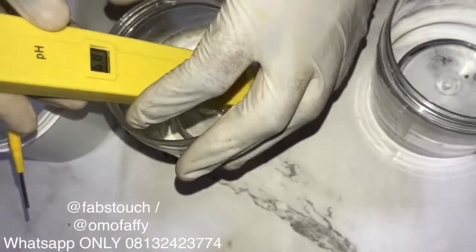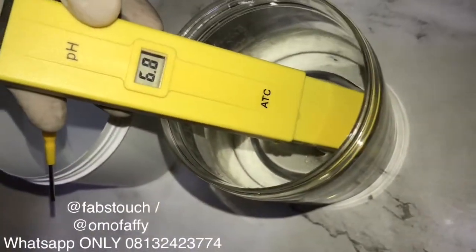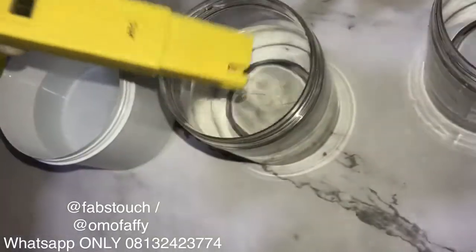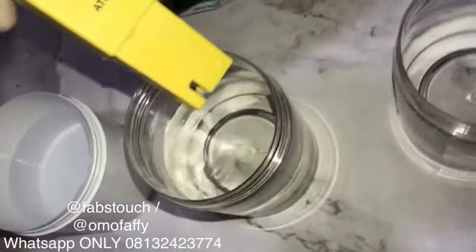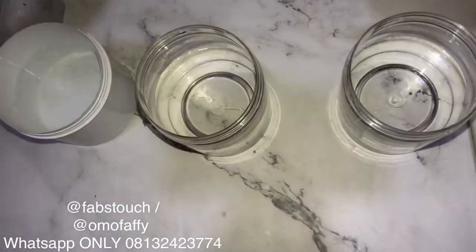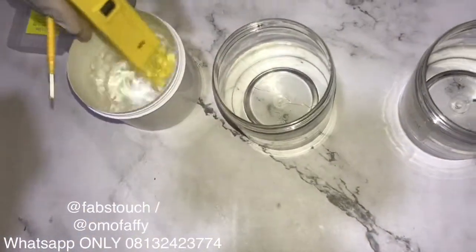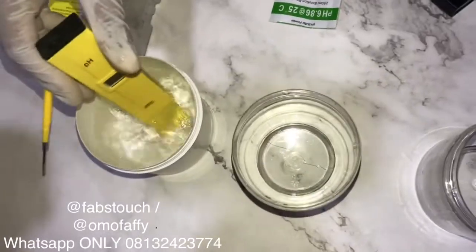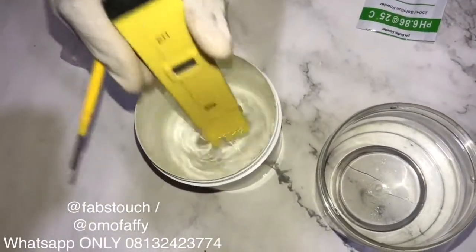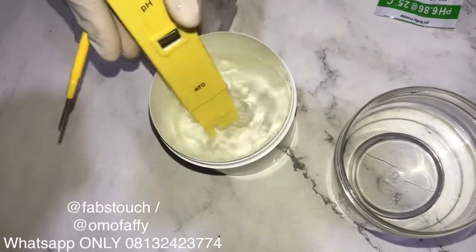Some pH meters read up to three decimal points, so you can achieve a perfect calibration with those. What we're doing now is retesting what we just did to make sure it's properly calibrated. Then wash off your pH meter before moving on to calibrate the second solution.